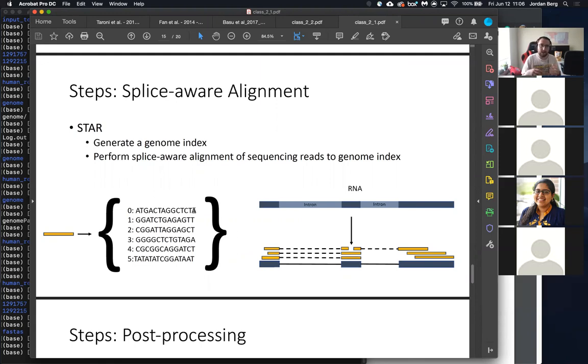And it's designed in a way where it can look at, okay, what's the first nucleotide of this read? And now here are the 100 sections in the genome that match up with that. Then within these, which ones also match the second nucleotide, what matches the third. So it works in this tree structure where it can quickly search the right location of that nucleotide. Does that make sense?